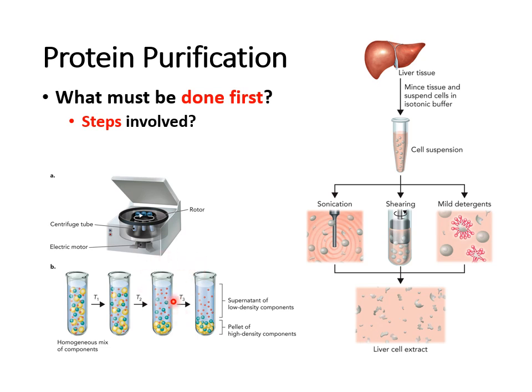Now, when you are doing this process, I want to point out that the way you're preparing that homogeneous mix or cell suspension is you can use either mechanical or enzymatic ways to break down the tissues. That's shown over here, how you're mincing the tissues.